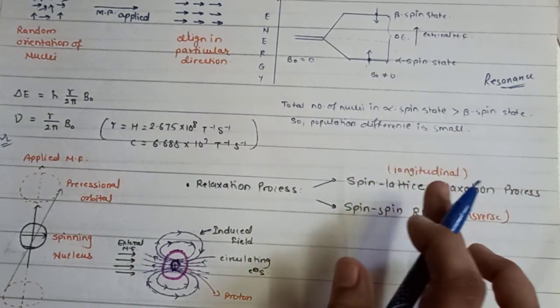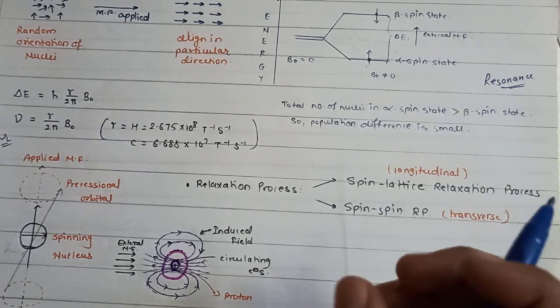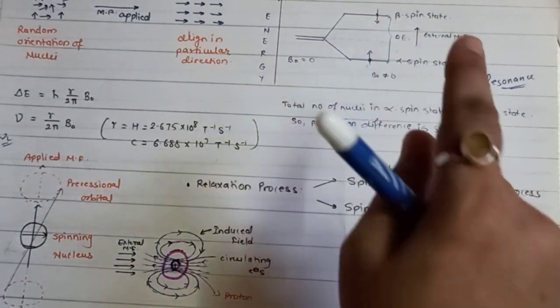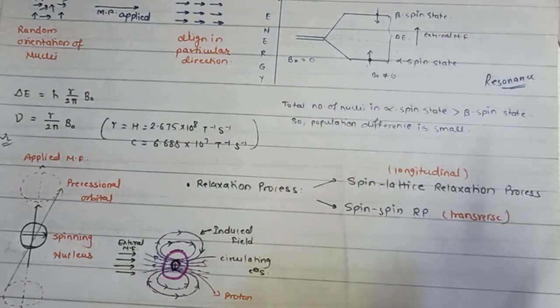तो यहाँ पे बेसिकली क्या है स्पिन लैटाइस मतलब कि जो भी हमारे यहाँ पे इंटरेक्शन हो रहा है बिकॉज ऑफ दिस लैटाइस, विल व्हेन इंटरेक्ट विद द न्यूक्लियस ऑफ द हायर एनर्जी स्टेट, एंड दैट टाइम दे आर गोइंग टू लूज देयर एनर्जी. तो उसे यहाँ पर हम लोग बोलते हैं स्पिन लैटाइस.